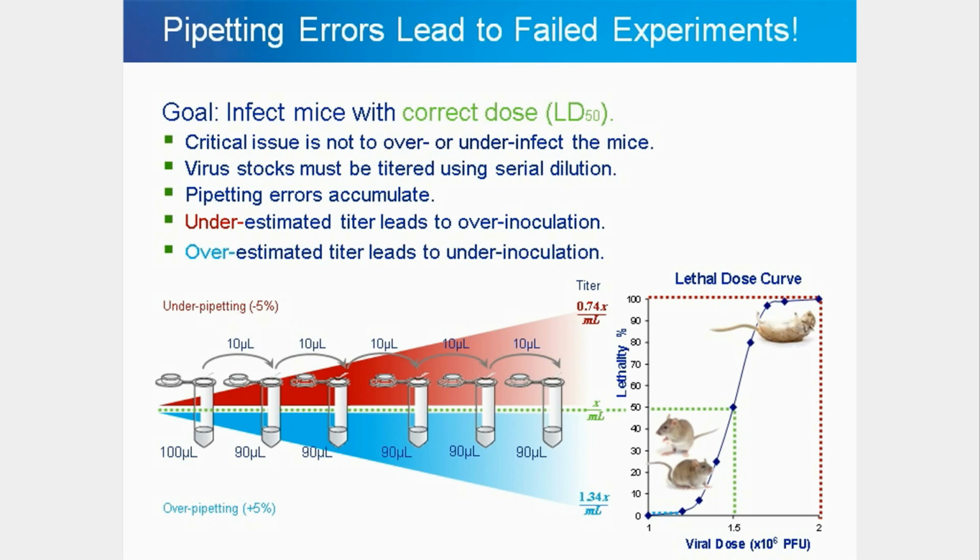This clearly shows you how important it is to know about correct pipetting technique in order to avoid pipetting errors and failure of experiments.